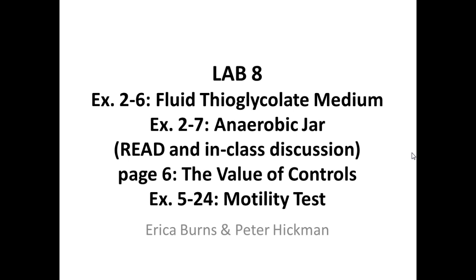And some of you guys don't actually have these tubes in your rack right now because I had to refrigerate them. And you'll find out today in the lecture why I needed to do that. Anaerobic jar, you guys read and should have taken notes on for homework. We won't actually do this experiment. We don't have enough of these jars working properly for all the classes to be able to do this experiment. So we do it as an in-class discussion, so we're going to discuss it now. You guys will still be quizzed and tested on it, even though we're not going to perform the actual experiment.